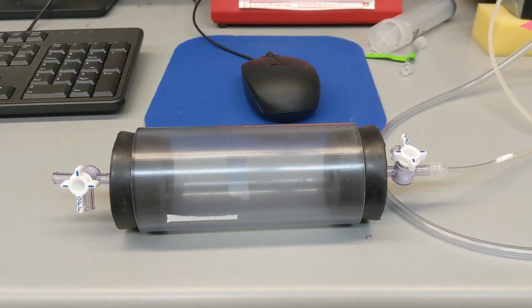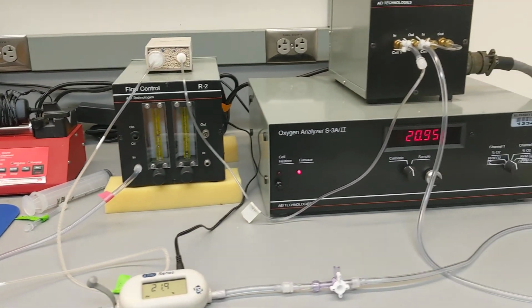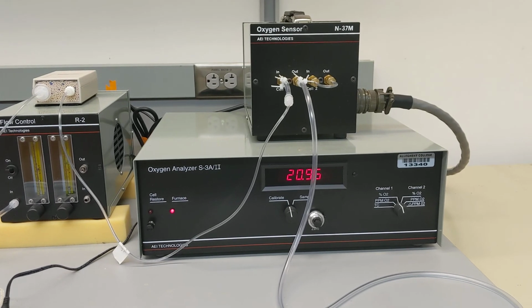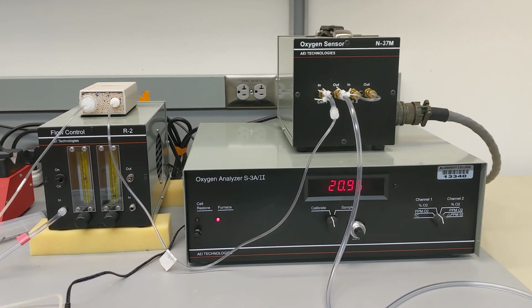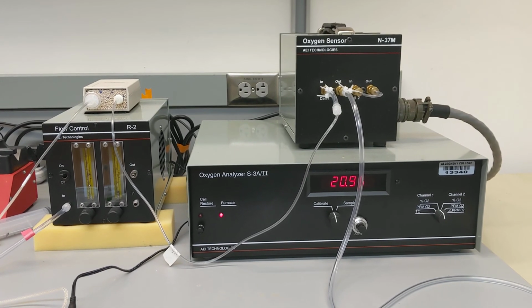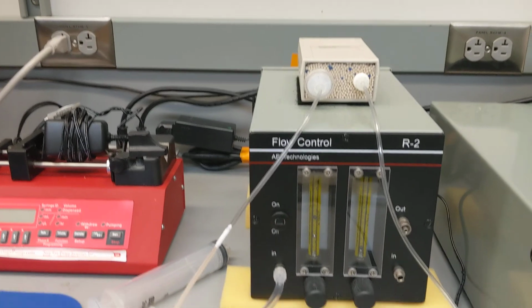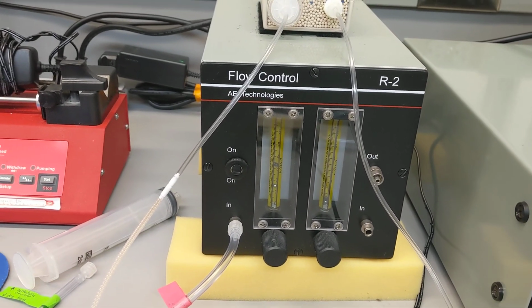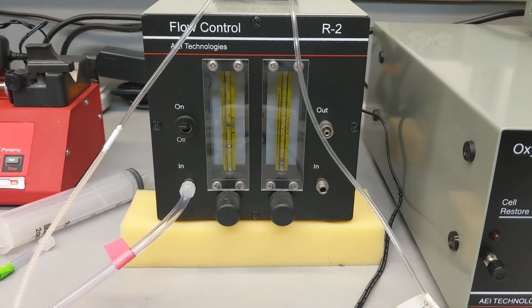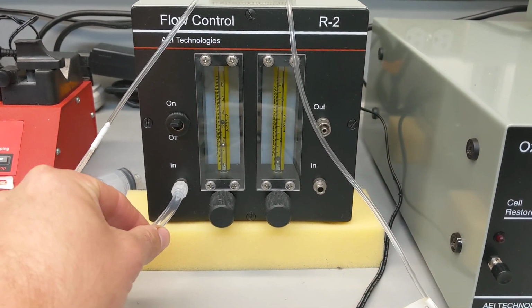And as the air gets pulled through here, it gets sent through a series of pieces of equipment, which I'll explain in 1 second, which are right here. And this gets analyzed, the percentage of oxygen that is in the air sample. So the best way to think about this and view this is starting off with this particular pump right here. This is the air pump, and it's pulling air through this valve right here.